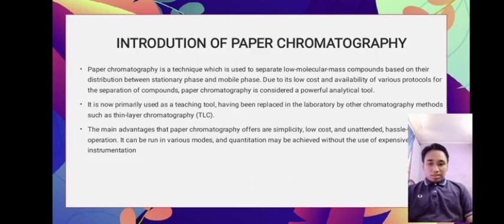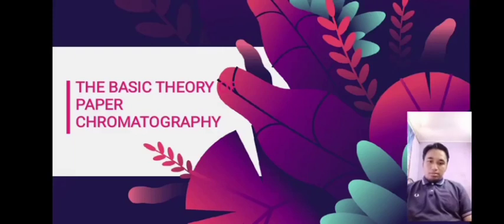The main advantage that paper chromatography offers are simplicity, low cost, and unattended hassle-free operation. It can be run in various modes, and quantitation may be achieved without the use of expensive instrumentation. Now, the basic theory of paper chromatography.